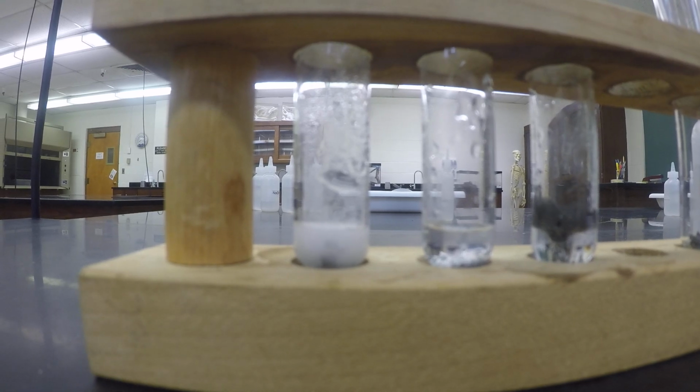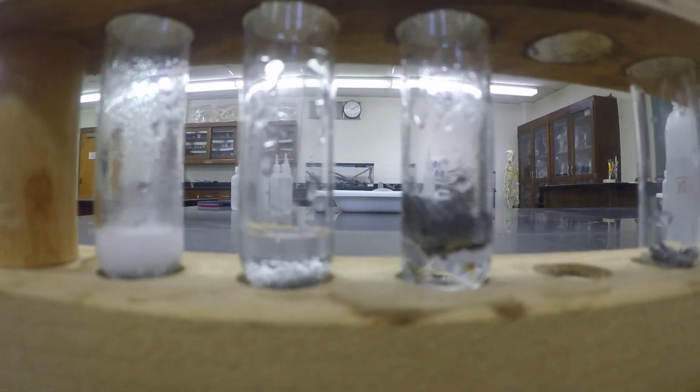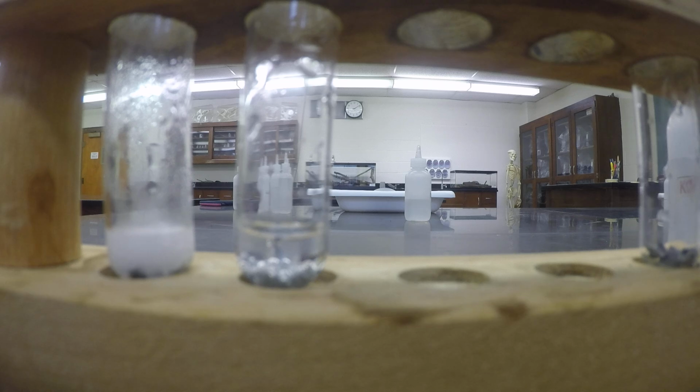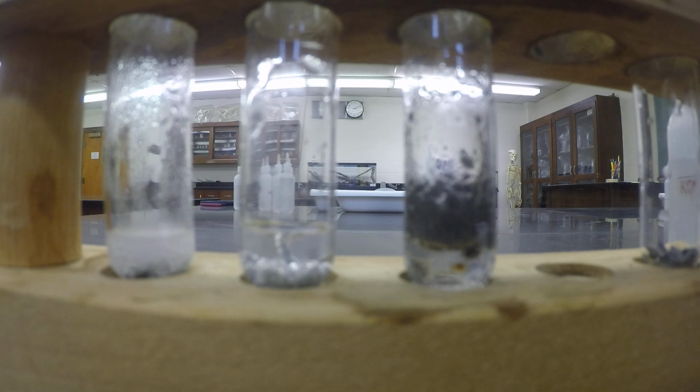You can probably even hear that one. You can see the gas coming off of it. Again, that is the magnesium with HCl. Let's go over to these two because they're a little harder to see. Shake them up a little bit. These two, you're going to let them sit there for a second. What you're looking for is movement. I know I can see some on this one.